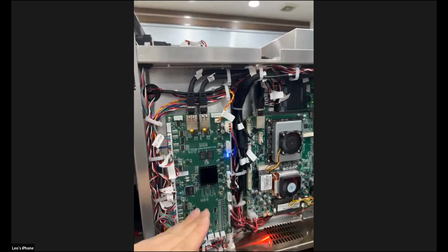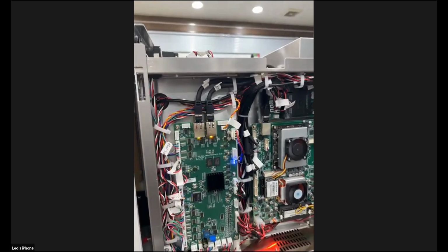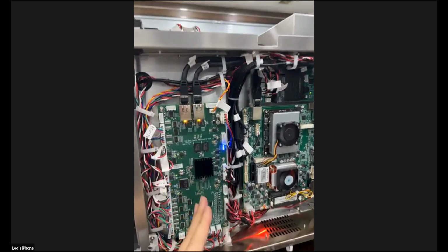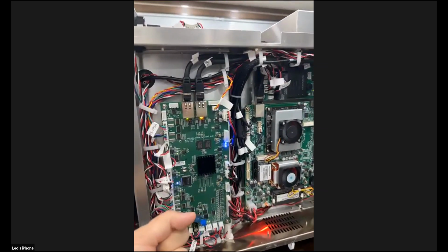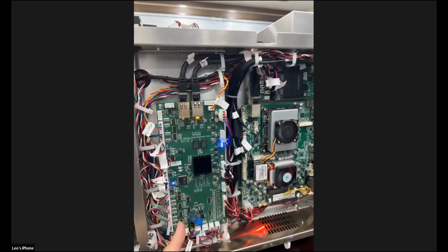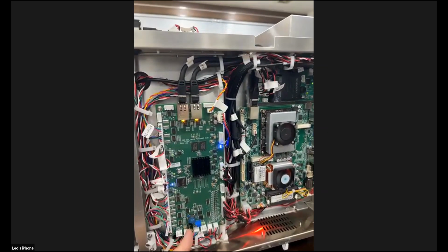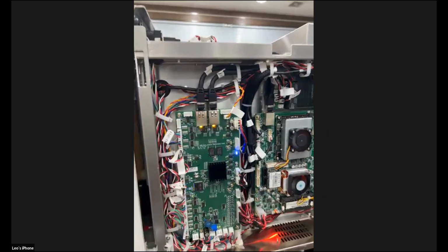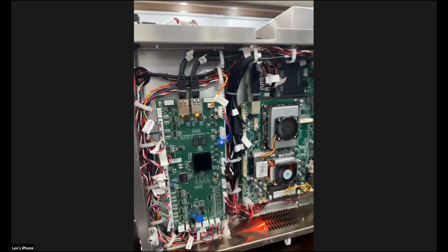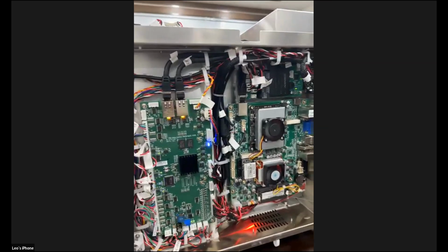It will control all of the valves, the motors, and all of this motion will be controlled from here. So this is very important, because from here we can control the circuit fluid direction, and then finish the sample test.